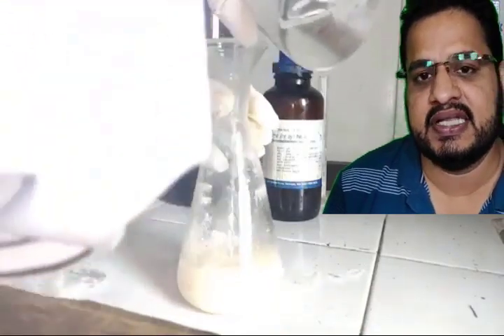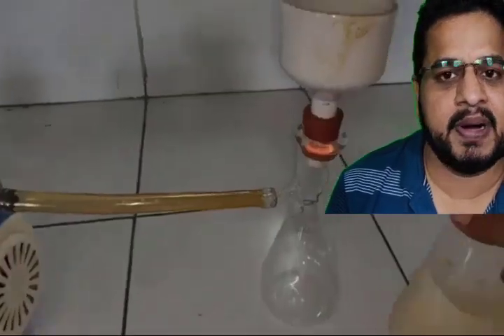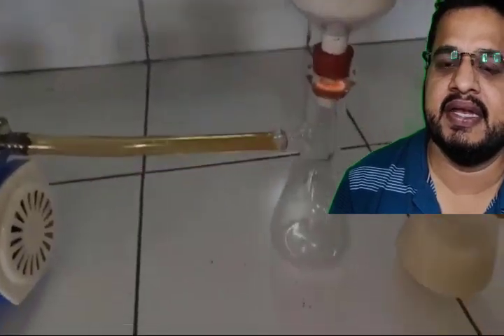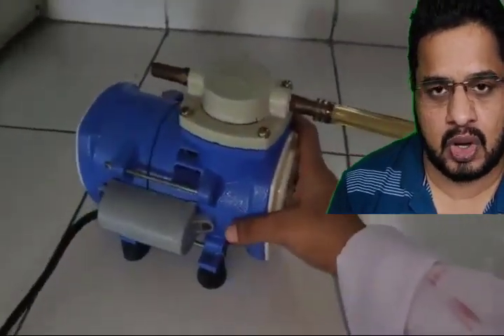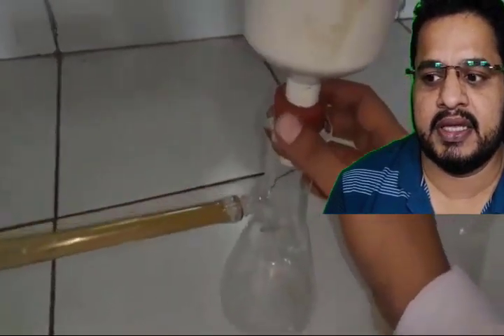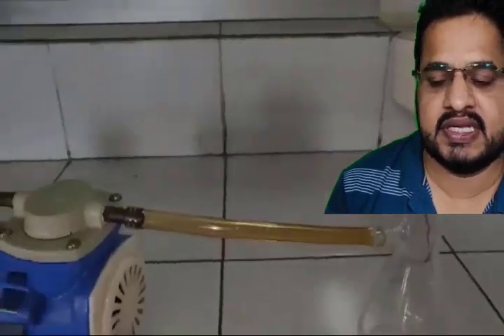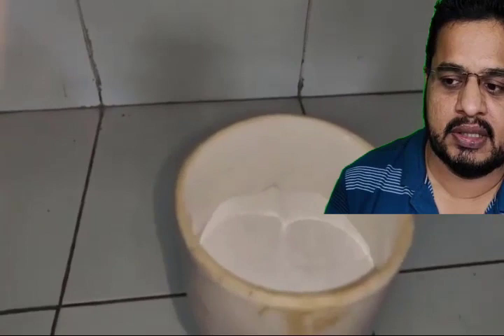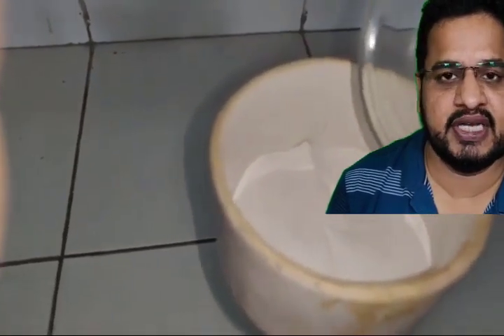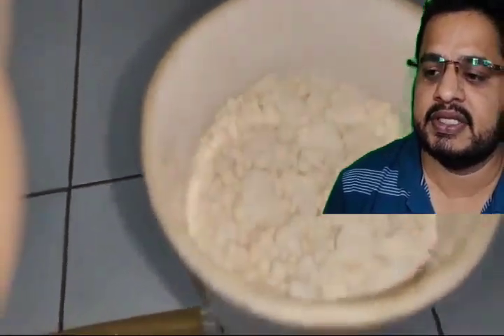Now we will filter this through the filtration assembly. This is the filtration assembly wherein a suction pump is there, suction flask, and the entire filter cork, and this is the filter paper I have put in this way. Once it is ready, we will pour the solution, shaking it, into the filtration assembly, and by suction all the liquid part will go off and you will get the solid.